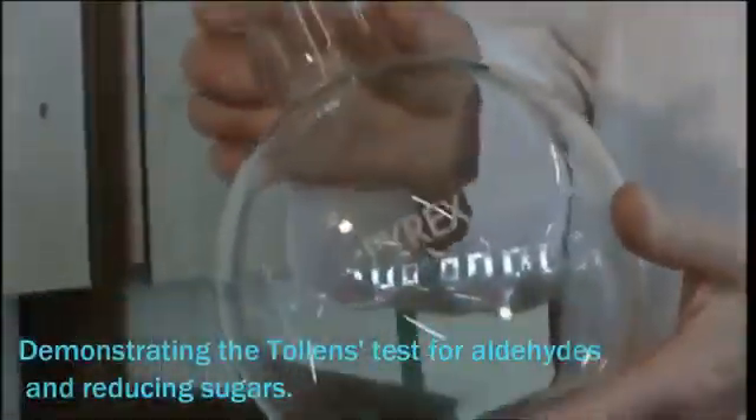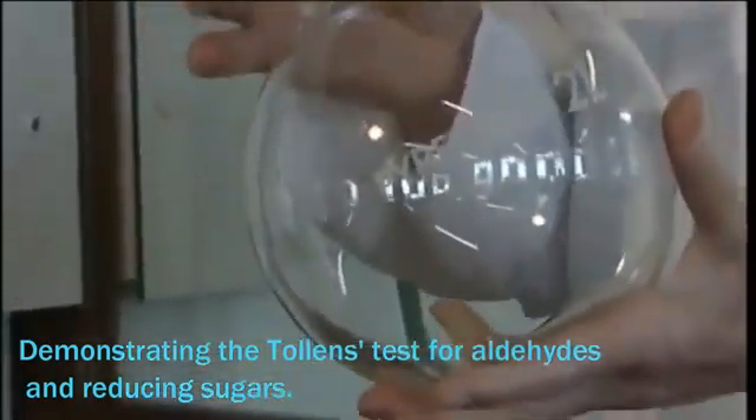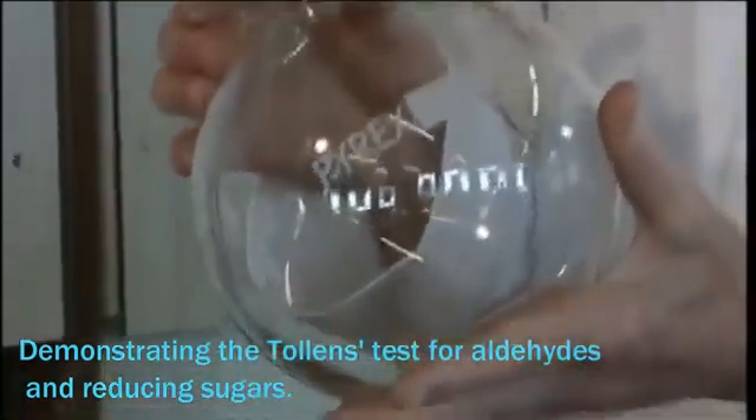The most important thing to remember about this experiment is the flask must be scrupulously clean if we are to get a good silver mirror.